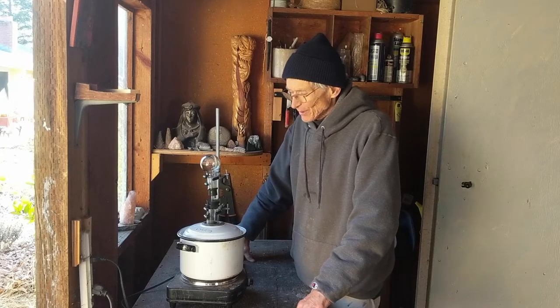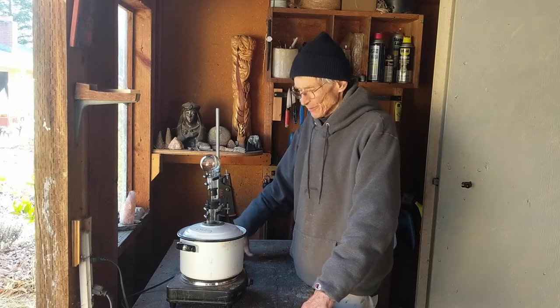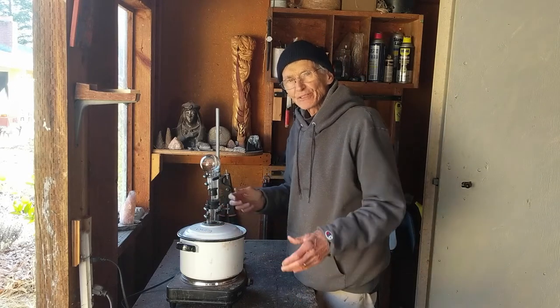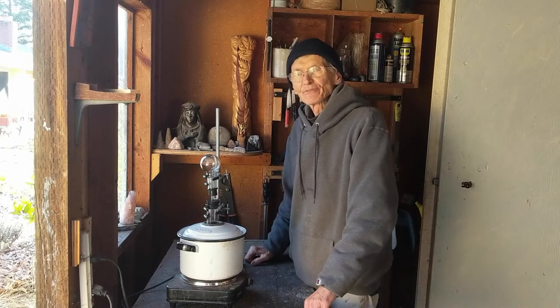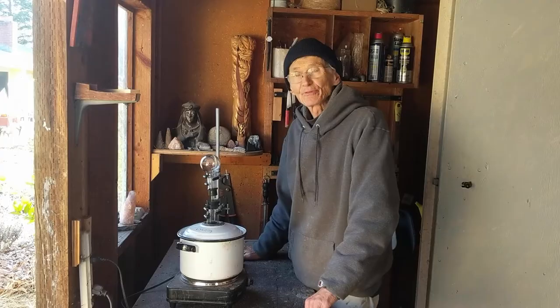Hi, it's December 21st, winter solstice. We're using this device called a Mary's bath to extract resin from some powdered myrrh to make a preparation called the Three Kings.